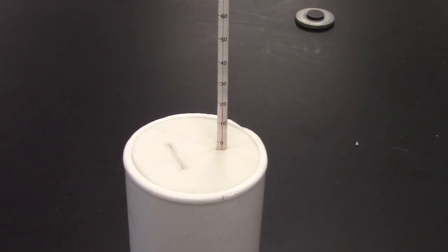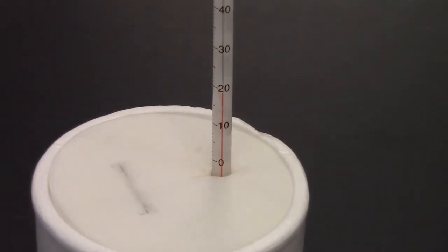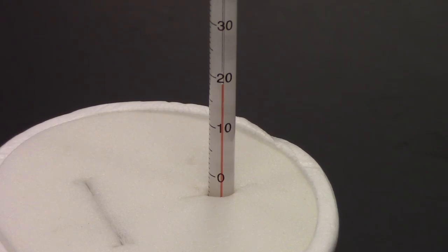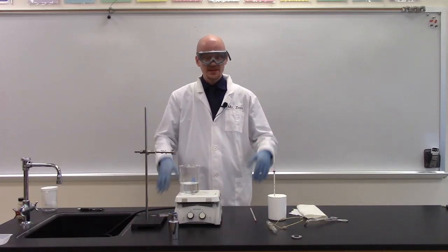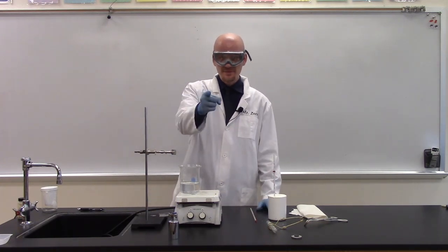Once the temperature stops rising and it's stabilized, I'm going to go ahead and note that temperature so we can perform our calculations. And that's it. That's the calorimetry lab. Be safe and have fun.